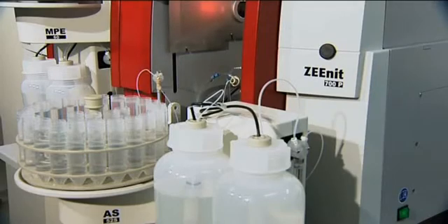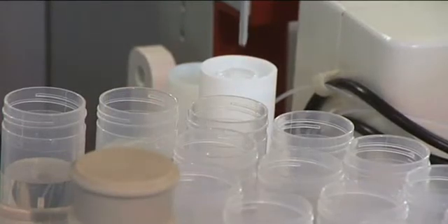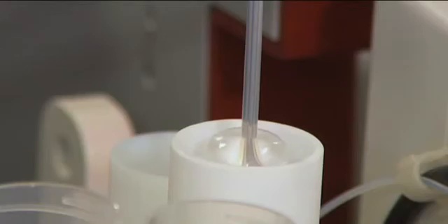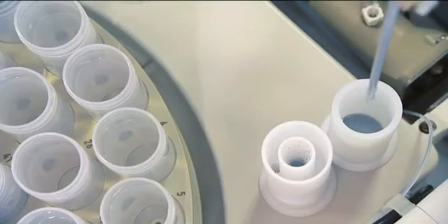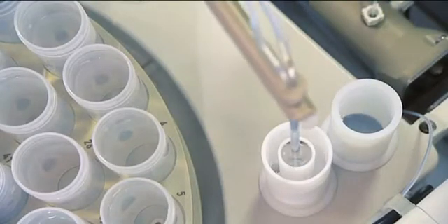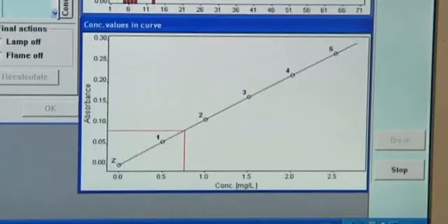The preparation of a series of standards with the autosampler with dilution function becomes child's play. You specify the number and concentrations of the standards and the sampler does the rest. The intelligent dilution function automatically dilutes samples which overshoot the calibration range by the appropriate factor.